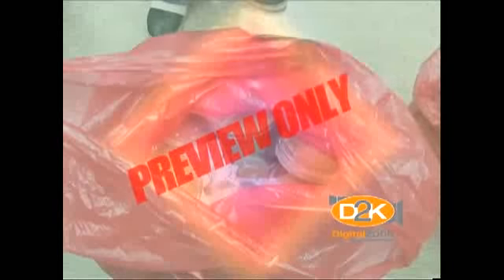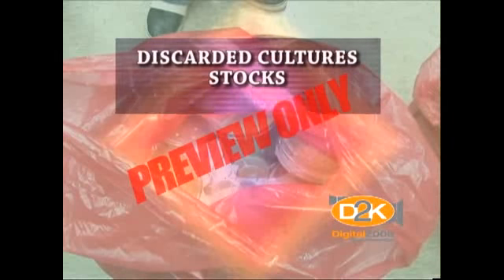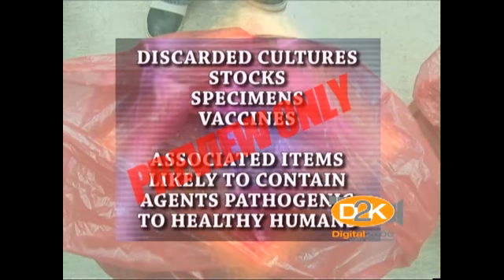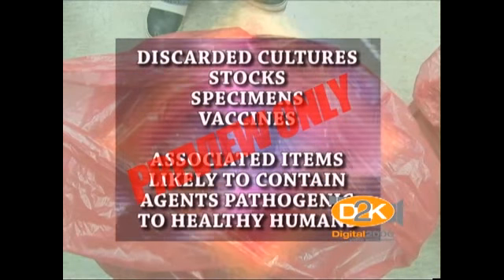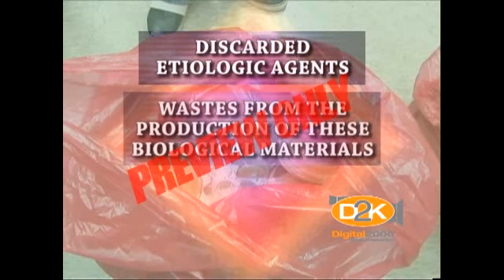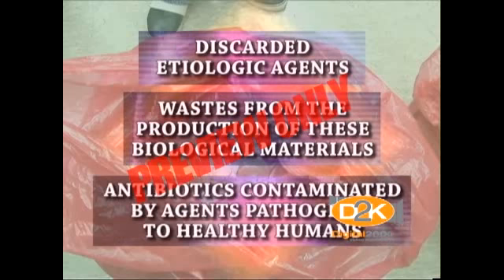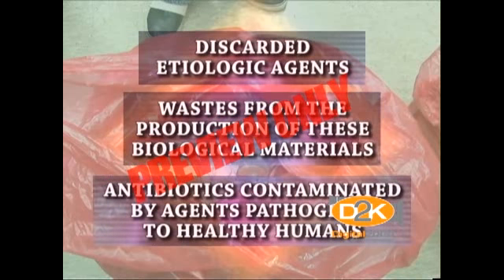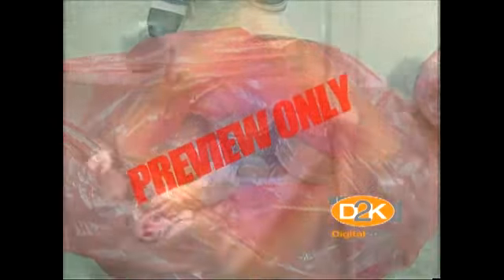These wastes include discarded cultures, stocks, specimens, vaccines, and associated items likely to contain agents that are likely to be pathogenic to healthy humans, discarded etiologic agents, waste from the production of these biological materials, and antibiotics likely to have been contaminated by agents that are likely to be pathogenic to healthy humans.